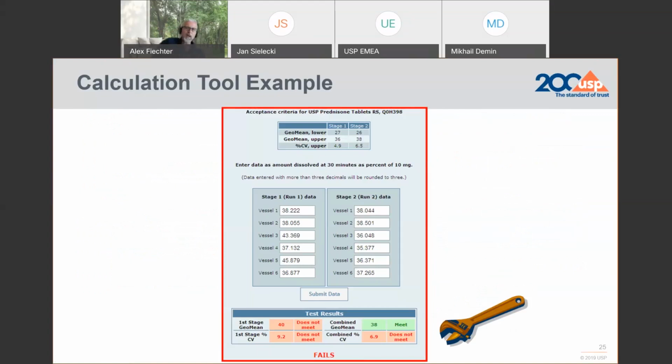We have on our homepage an Excel file, a dashboard, or a spreadsheet that is available under our toolkit, where you can quickly run raw data and get some results for your immediate visual. This is not a validated Excel file for your routine purposes. If you want to do an Excel spreadsheet based on the calculations and equations as provided in the certificate, you have to validate this on your own first.